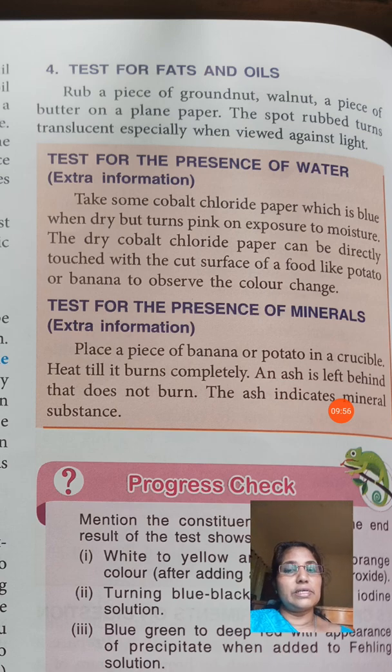Heat till it burns completely. An ash is left behind that does not burn. The ash indicates the mineral substance. Other content present in that food material, such as carbon dioxide or nitrogen, may turn into gas and escape. If some unburned substance remains in the crucible, that shows the presence of minerals in the food particle.